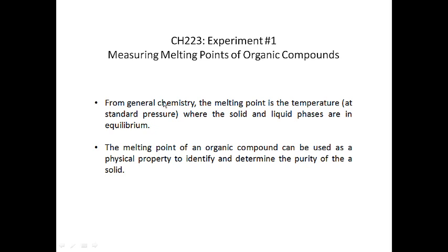So in experiment 1, you're going to learn how to measure the melting points of organic molecules, and then use the mixed melting point technique in order to determine the identity of an unknown solid.